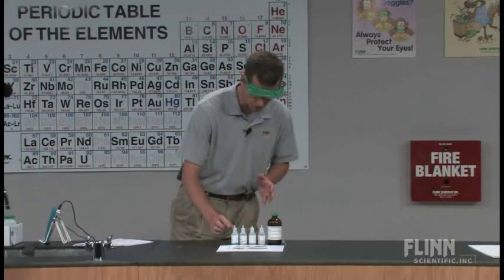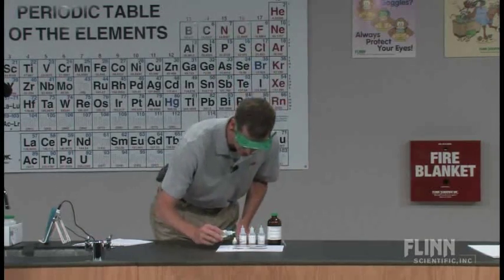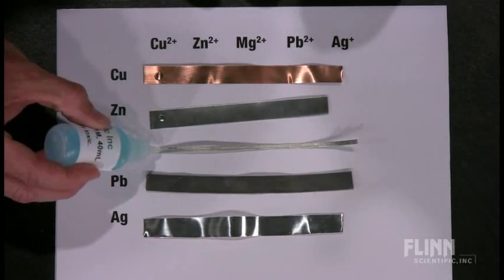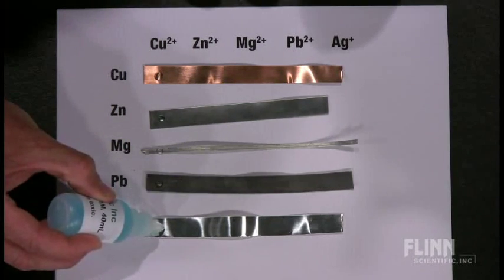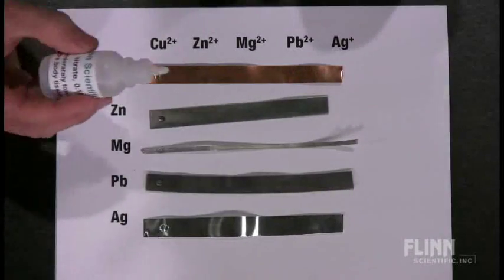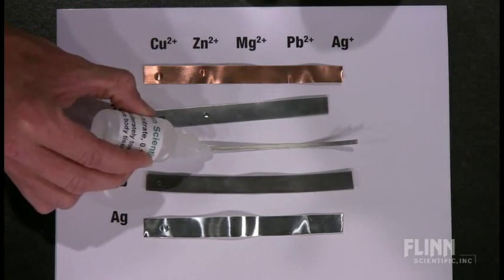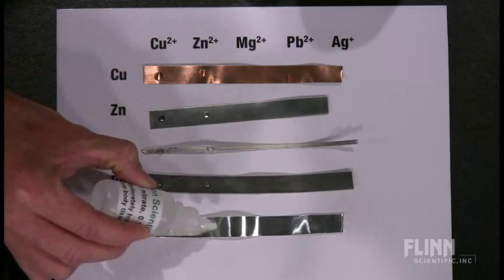So what we're going to do is put a drop of each of these solutions on here. I'm going to begin that process now — we'll take the copper(II) nitrate and we're going to see a data table start to form. The magnesium you've got to be a little careful with because it's a pretty thin strip. Then we will take the zinc nitrate and put a drop on each metal. What we're looking for, the evidence of a reaction, is a precipitate forming in that drop.